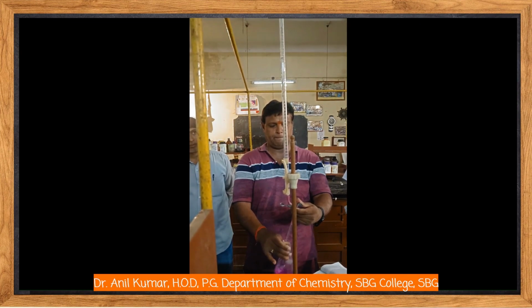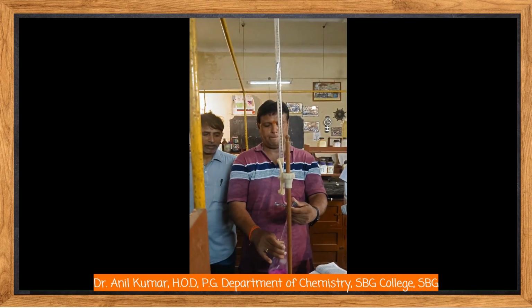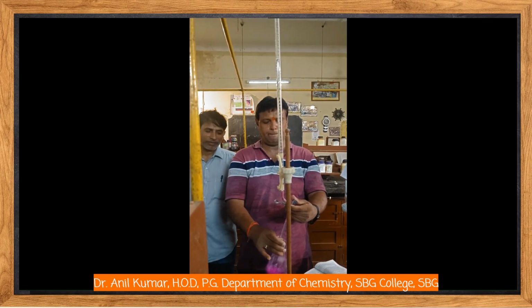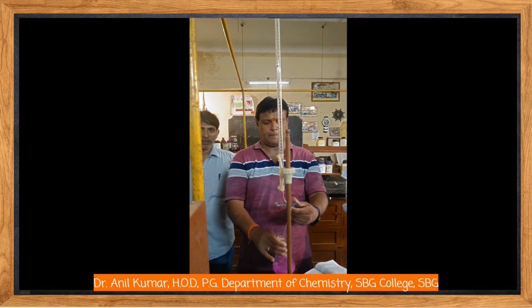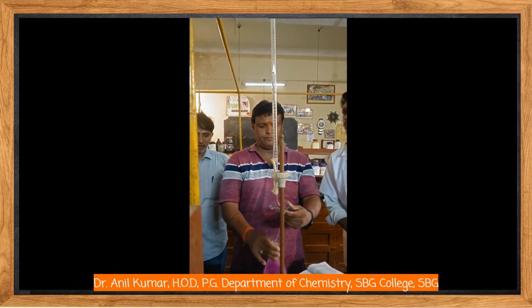Number six, now add 1-2 drops of methyl orange indicator in the same colorless alkali solution, which becomes yellow in color. Number seven, now again titrate it against standard HCl solution contained in the burette. Number eight, at the end point of the last step, the solution changes its color from yellow to orange to red. Note, all the apparatus should be clean and use both indicators in the same alkali solution.